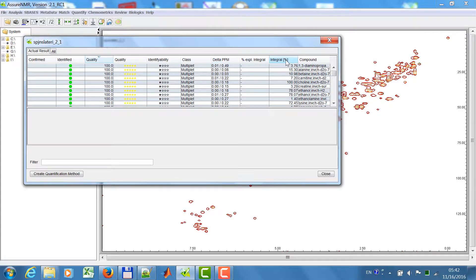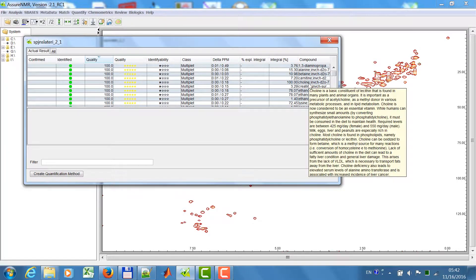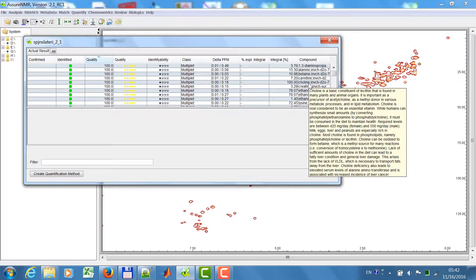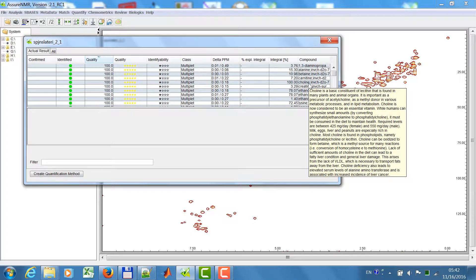In this column you will see the relative integrals. The integrals are normalized to a single proton and then referenced to the highest signal in the spectrum. In this case this was choline. If you go here to the compound then you will see the biological information which was imported from the HMDB.